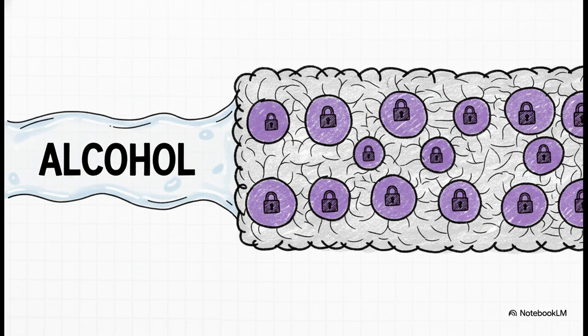So, let's go back to our process. When you hit that thick wool sweater of the gram-positive cell with alcohol, it actually shrinks the fibers. The pores in that peptidoglycan mesh get smaller. And that physically traps that big purple dye molecule inside. It's not going anywhere. It's totally locked in.